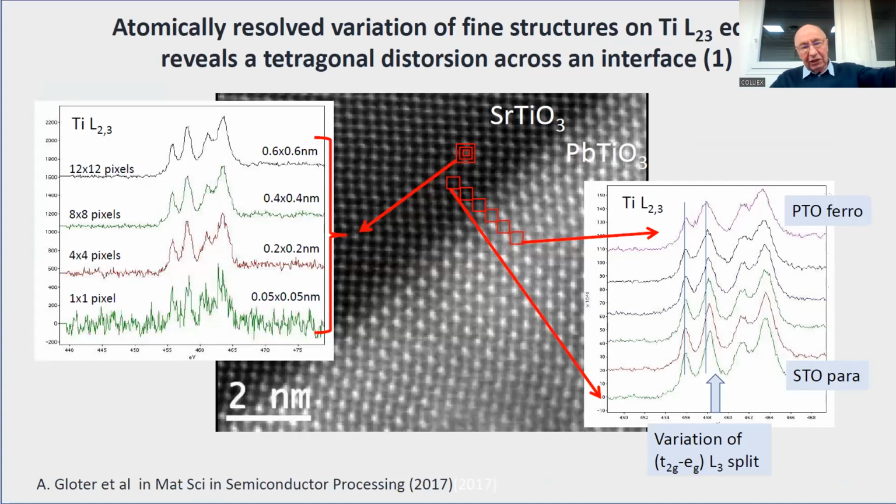Now, from single atoms, let's move to what we can learn with lattices. This is a typical lattice on which there were many studies. These are 2 specimens, strontium titanate and lead titanate. Typically we have the spatial resolution of the atomic column, obviously. And the contrast is that these columns in the bottom part are much whiter than the upper columns. The fact that they are much whiter is because they are made of lead. The top level is made of strontium.